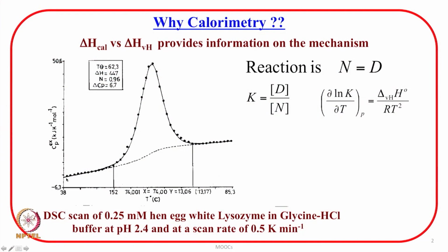And let us say, if we want to establish the calorimetric reversibility, look at this slide. This peak is associated with the unfolding of the protein.